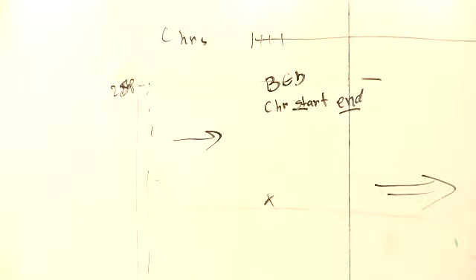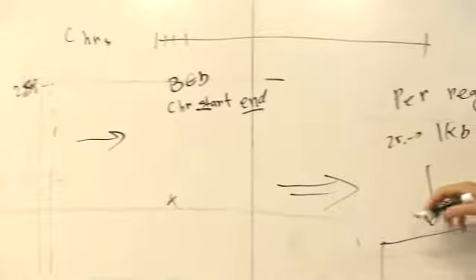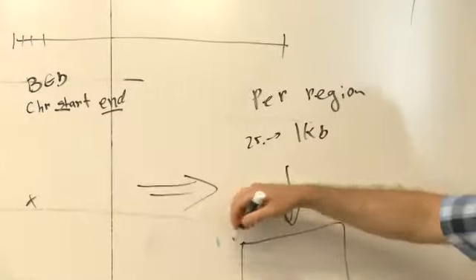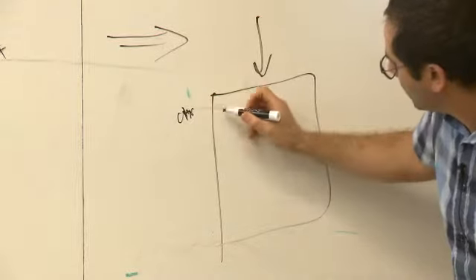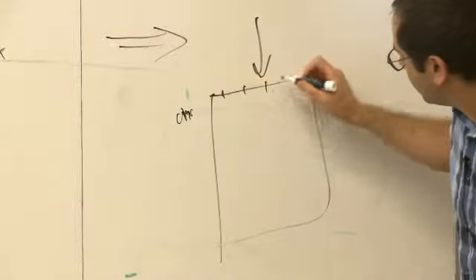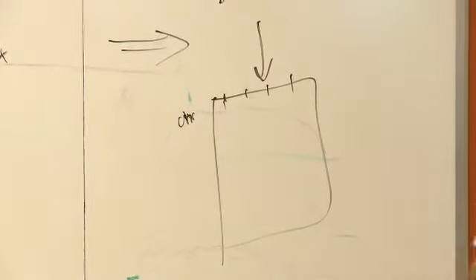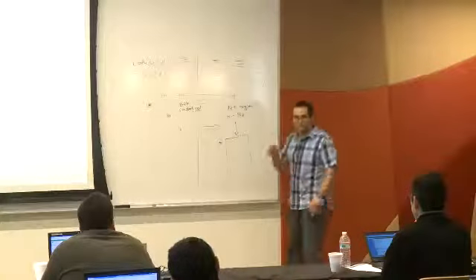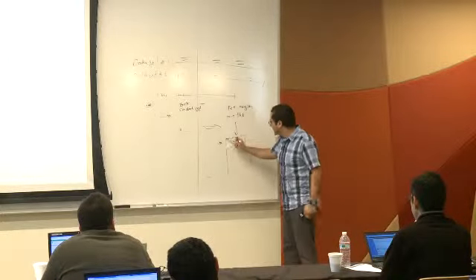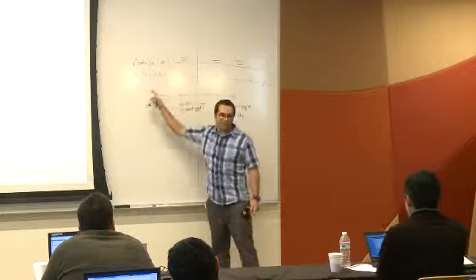It's going to make a matrix that will tell you, OK, on this chromosome location, you're going to have these areas, and they have the average or the max or the median score. Again, this depends on the parameters you choose in GenePattern. And we can make it for data set number 1 and for data set number 2.